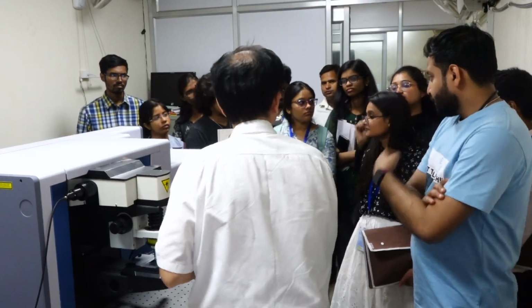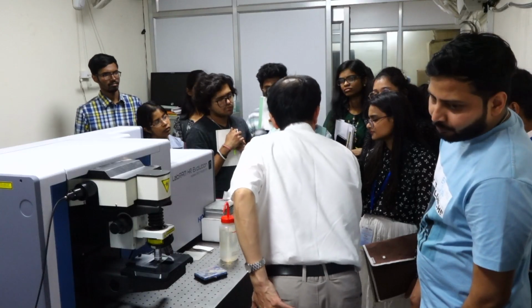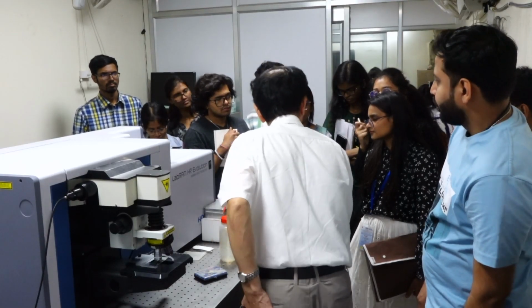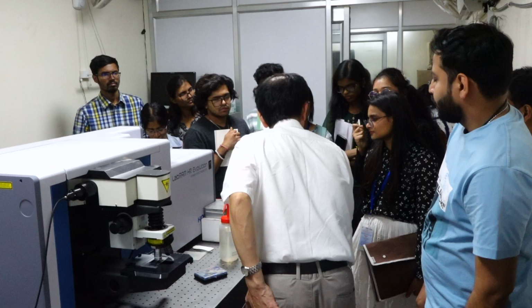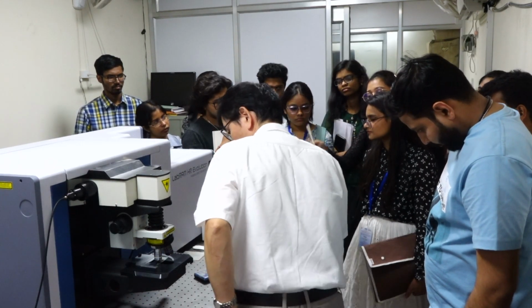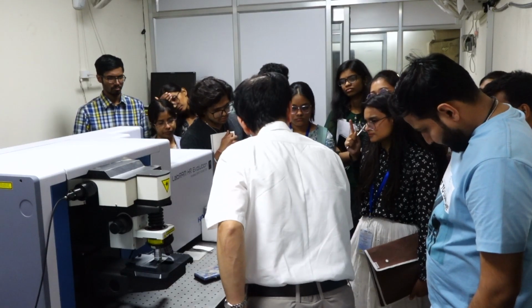So what is the need of signal correction? In one only, like the upright position, if the light is coming from the upright or the downside, you explain the signal correction in one of them only.